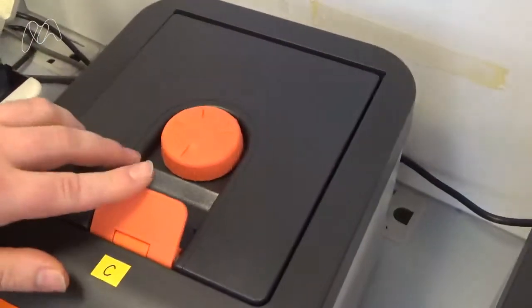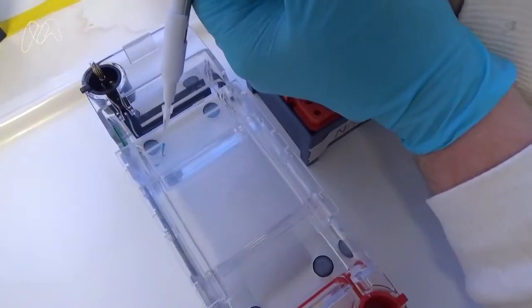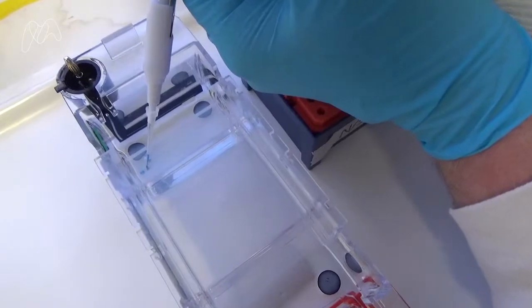After that, we took the DNA from inside the cells and made multiple copies of a particular gene using PCR. The gene that we're interested in is like a genetic fingerprint which we can use to identify the DNA. Last video, we were using electrophoresis to confirm that the PCR had worked.